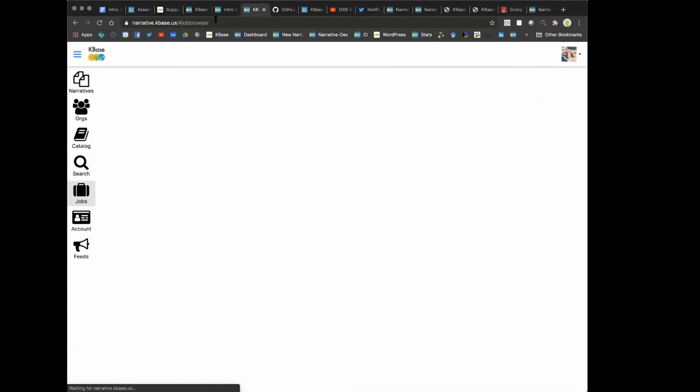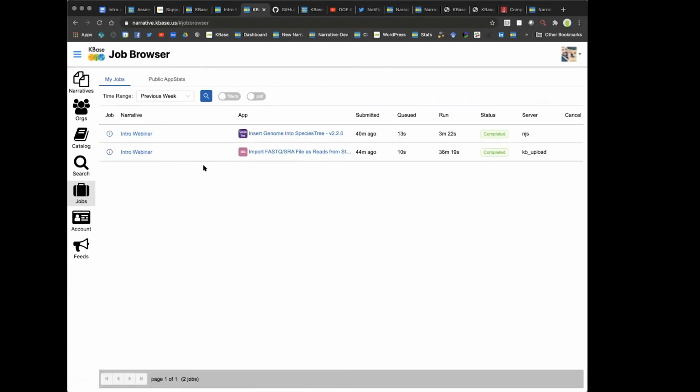Maybe it is not loading that up right now. I think I recall seeing some chatter that the jobs browser might not be operating at 100% right now, but no. Okay, here we go. Yes, now that loaded as it was supposed to.